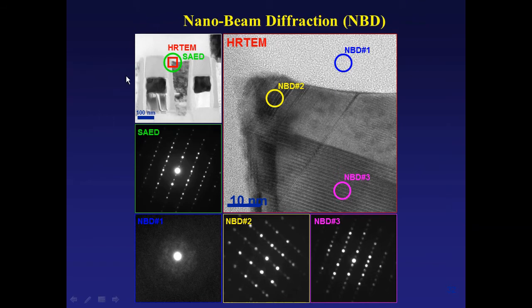The specimen was a part of a semiconductor here. This is a lower magnification observation. This interface was magnified here. Silicon single crystal, and also outside is an amorphous area. The beam diameter is about 5 nanometer, comparing with the 10 nanometer scale marker here.